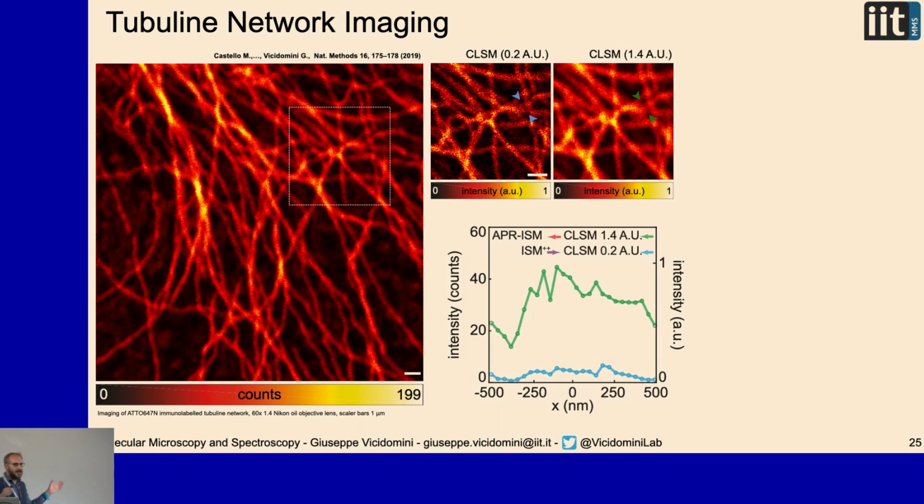Here is what happens if I open the pinhole, so I collect all the light. One particularity of this detector, since it's a big detector, is that it collects all the light coming from the sample. Thereby, I collect more light. As you see, there is an intensity increase.